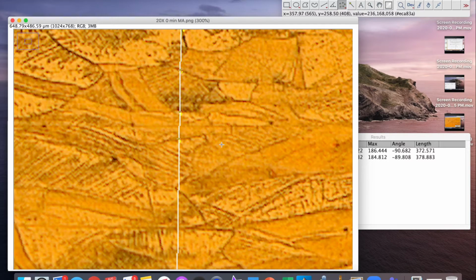So in this case, excuse me, we have lots of points, and so you may lose track eventually. So this is one way to replicate what you might do on a piece of paper by making a dot, right? So you could use this multi-point feature. So that's one tip you could potentially do for making this go easier.